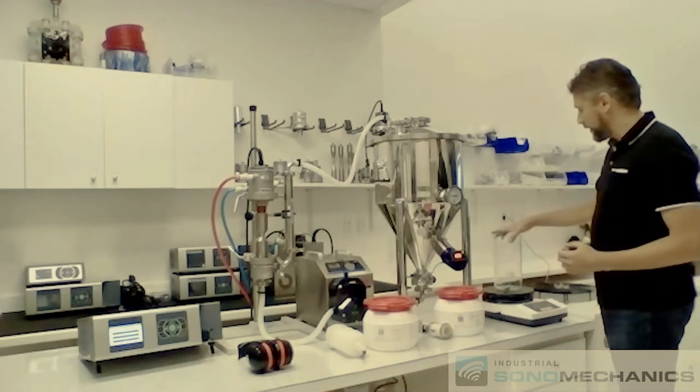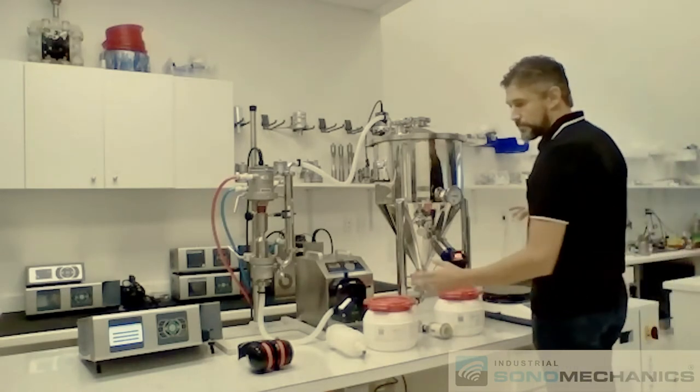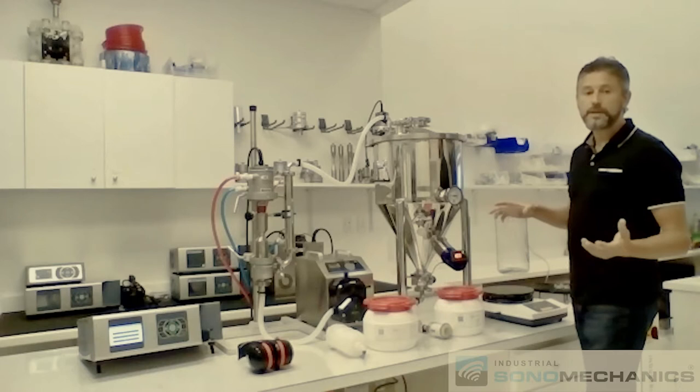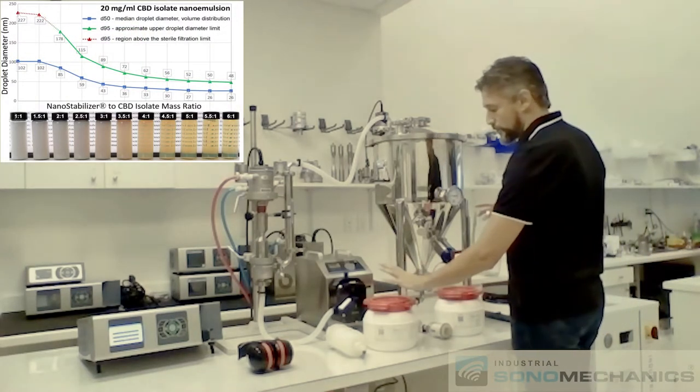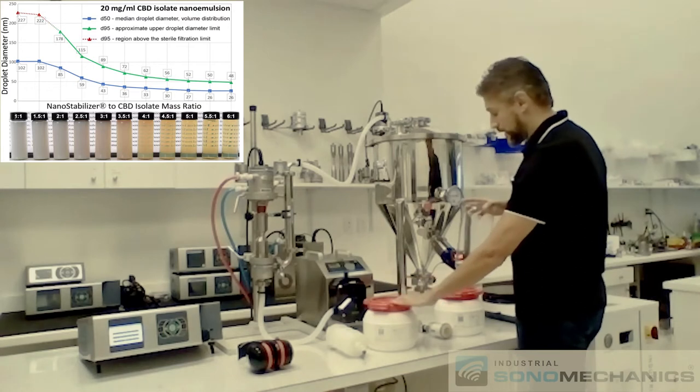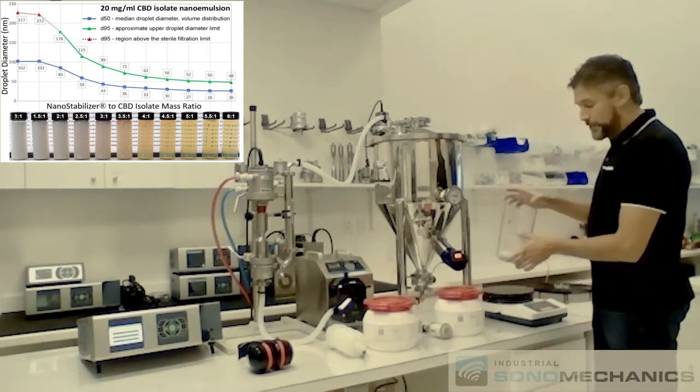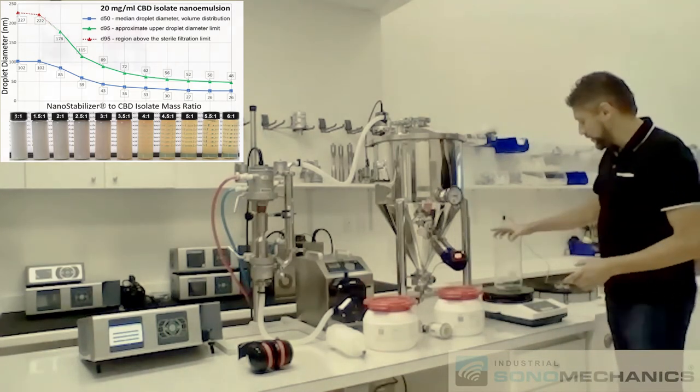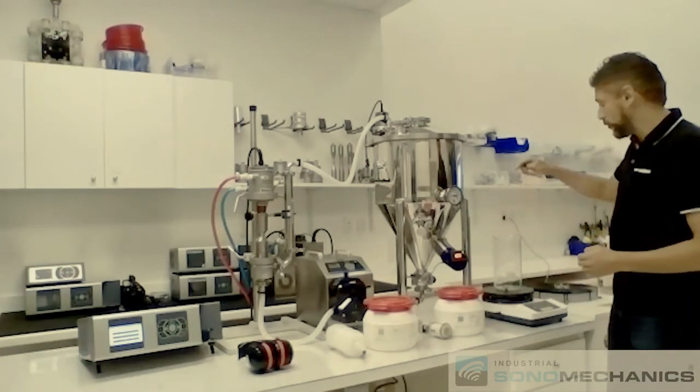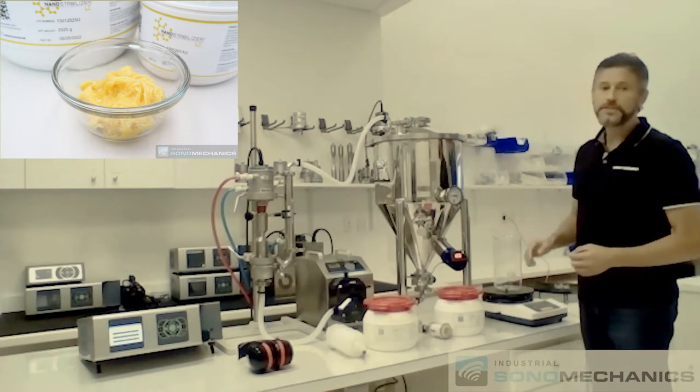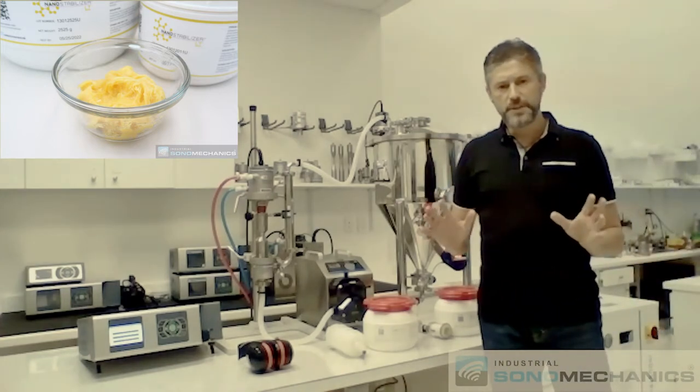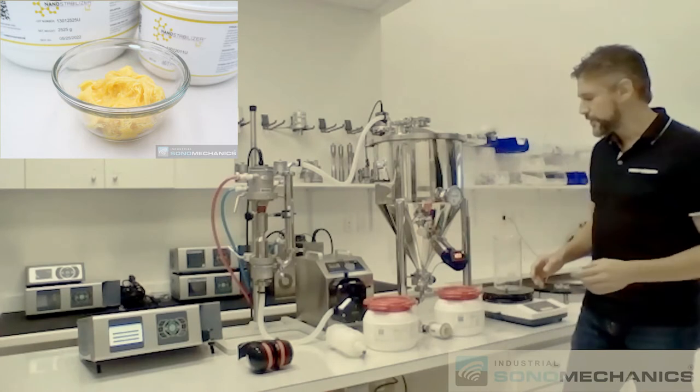As the first step, you would take your nanostabilizer. Let's say we're making a liquid translucent nanoemulsion. You would take the appropriate amount of nanostabilizer LT, place it in this container. That would be on the magnetic stirrer or you could use an overhead mixer. You would need to warm it up to melt it. It melts very easily at about 50 degrees Celsius. It's pretty much in the liquid state.